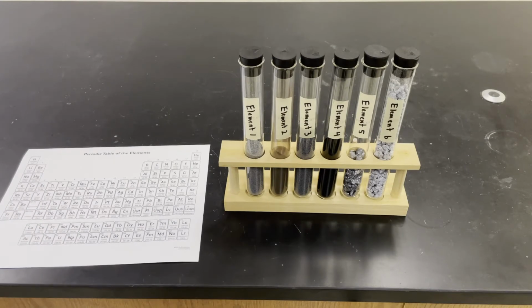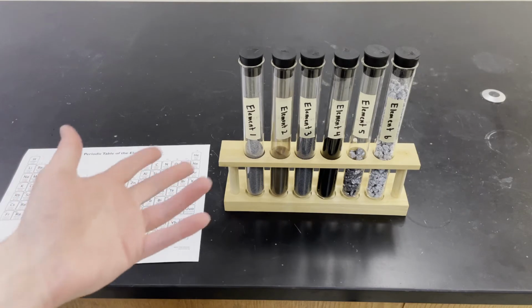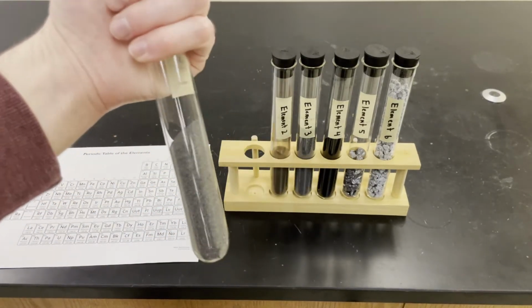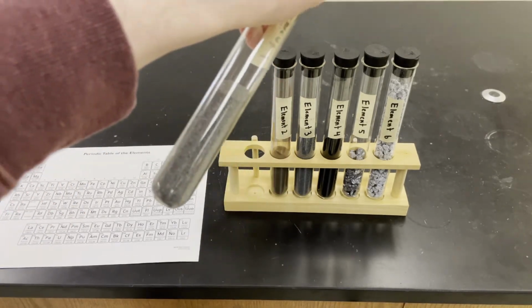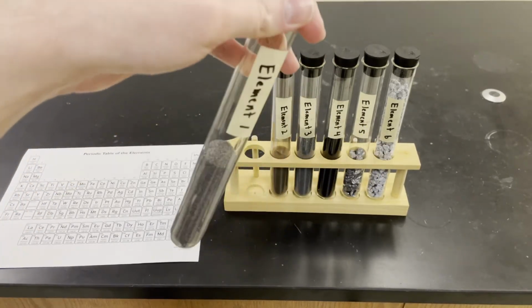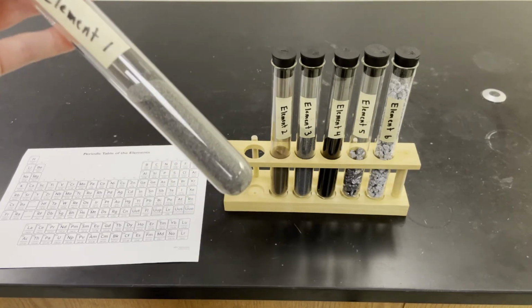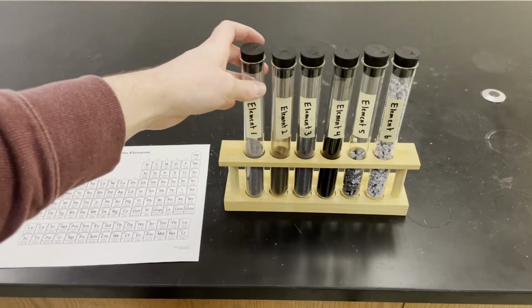All right, let's look at some examples of elements and see if we can identify them based on their molar masses. All 6 of these elements here are each 1 mole of that element. Whatever this is, 1 mole of something, I can find straight off the periodic table. It's not a compound, it's just a regular element. And there's exactly 1 mole of it, 6.02 times 10 to the 23rd particles. That means that if I can figure out the mass of it, I can just find the mass of that 1 mole, the molar mass, on the periodic table to identify it.